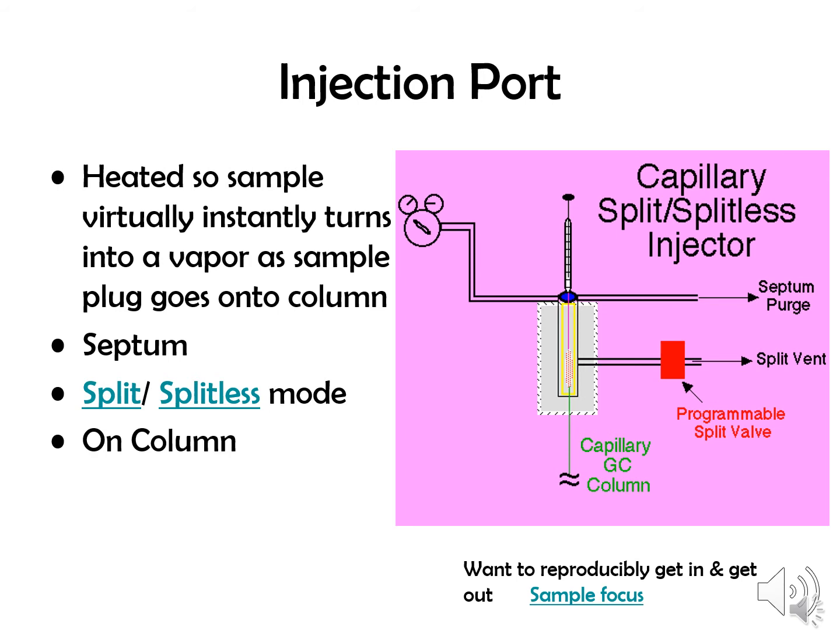You can control that. If you want to get more on the column, there's something called the splitless mode, where you turn the split valve off for a period of time and then turn it on to blow the rest of the solvent out of the system. And then in some cases, a little bit rare, you may not have any splitting going on at all. You just inject directly on column, and you'd have to inject a very, very small volume of sample in that port.